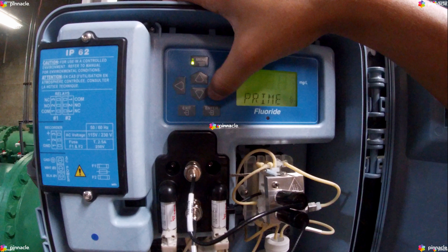The All option stops the current cycle, primes standard one for 90 cycles, standard two for 90 cycles, and then 90 cycles of the reagent.